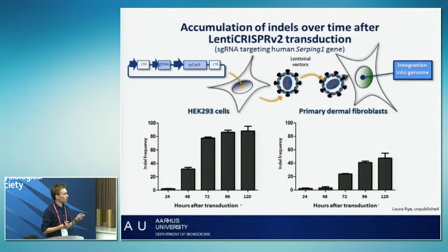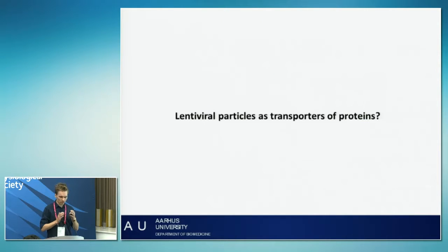As I said, characteristic for the lenti-based systems is that they integrate into the target cell's genome. And that's one of the things that we in our lab are trying to challenge. So we've asked ourselves, can we use these lentiviral particles as transporters of proteins instead of genes?